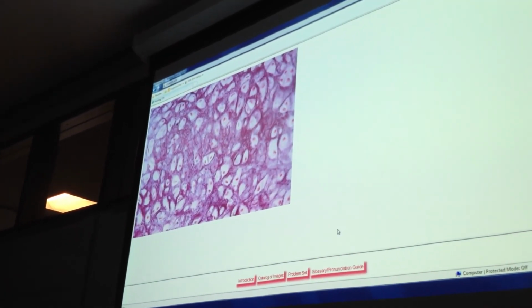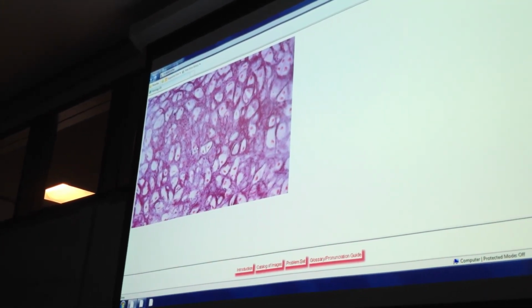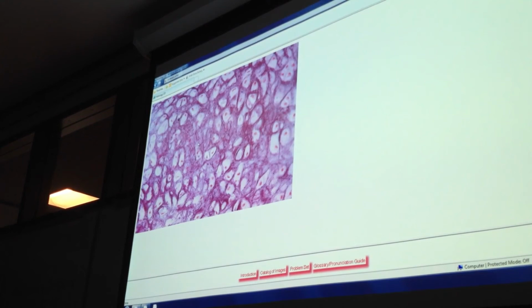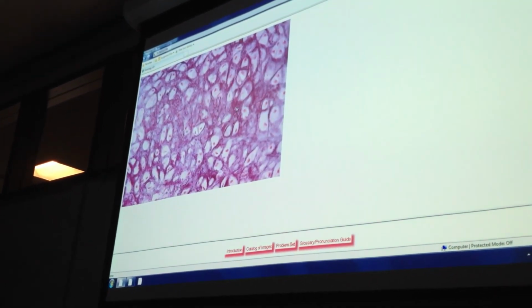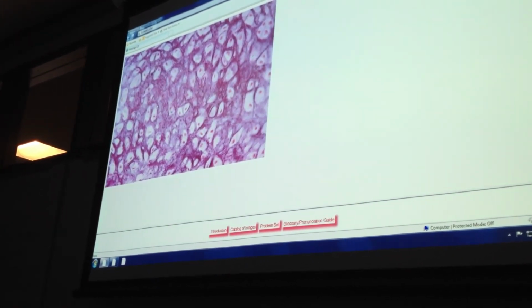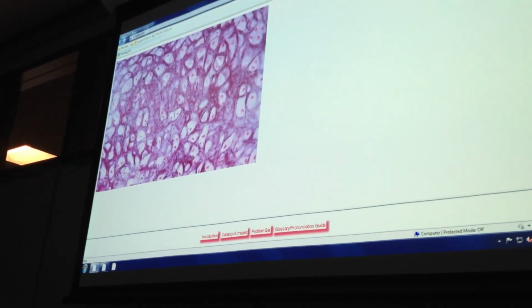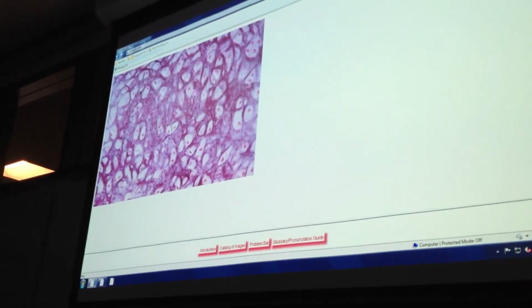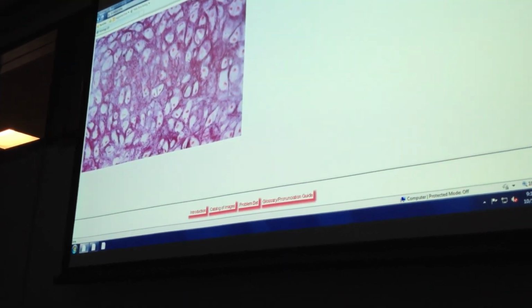Okay, now look at this guy closely. Number one, it's not clear. And you see all those little black fibers in there, right? Okay. The openings are lacuna. So this is elastic cartilage. You've got the elastic fibers and the lacuna.